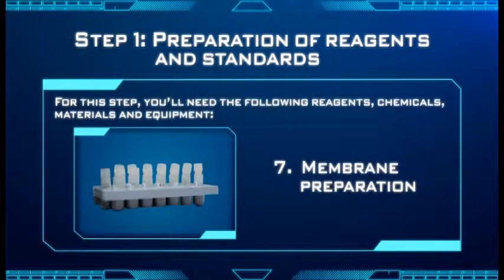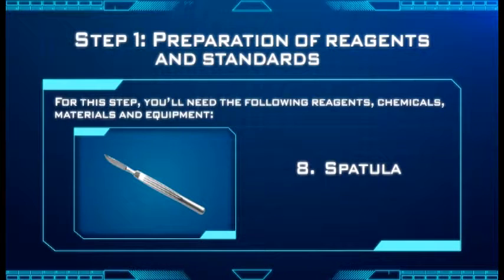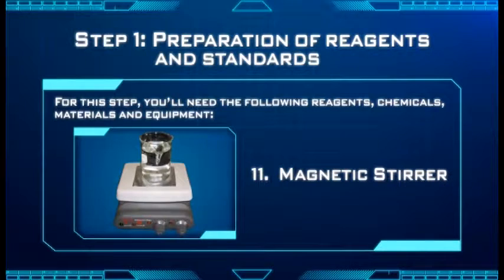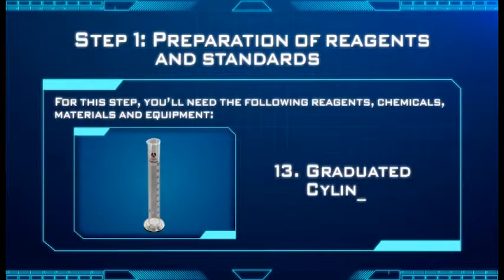7. Membrane preparation. 8. Spatula. 9. Reagent reservoir. 10. Beakers. 11. Magnetic stirrer. 12. Volumetric flasks. 13.